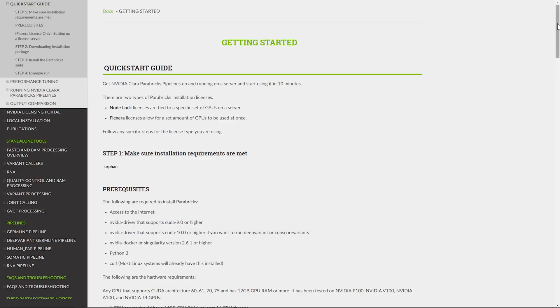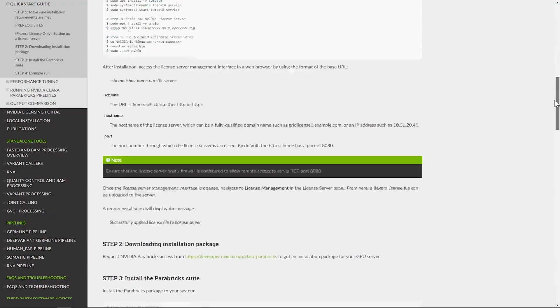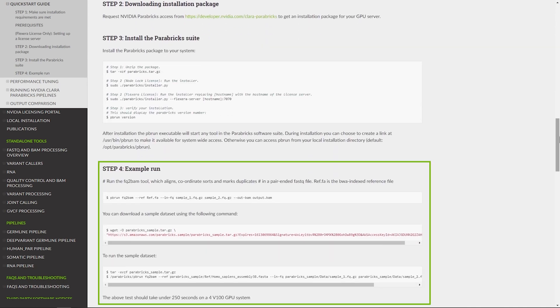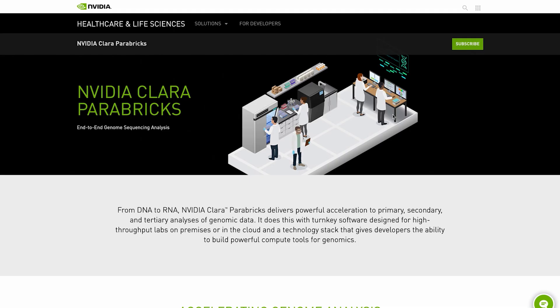We'll show you how easy it is to start using Parabricks. In minutes, you can download, install, and run a secondary analysis pipeline with a few lines of commands.